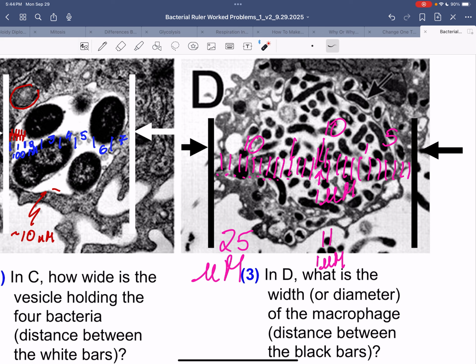that fits. We have one other thing in here that could help, which is this nucleus. Now, we're only seeing a part of it, but if this is the nucleus, it's pretty long. This nucleus would be 15 plus a little bit perhaps microns based on our estimate here. And that would be pretty large for a nucleus, but two things: nuclei vary in size, and plus they're not always entirely spherical.